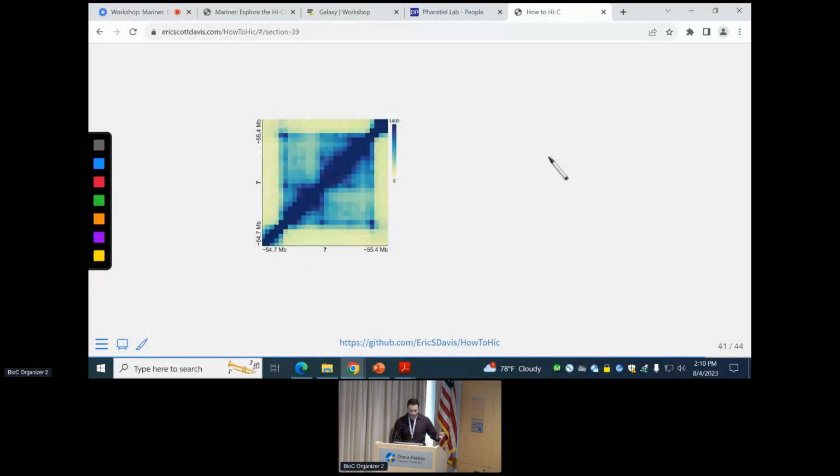So this map here has pretty large bins. Each bin here is 25 kilobases. So in this square highlighted region here, we've got a 75 by 75 KB slice of data. One thing I should also mention is that, while looking at this map, the diagonal as I've drawn it before was down this way.